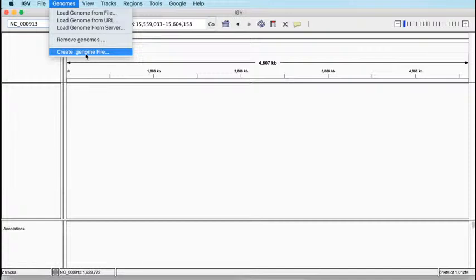As long as you've got a genome and maybe a GenBank file for annotation, for genes and so forth, then it should be relatively straightforward to create a genome file from your own reference genome. So you're not completely restricted to the genomes available through that list.